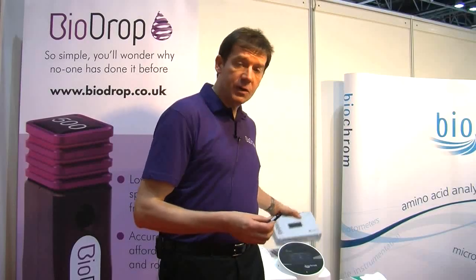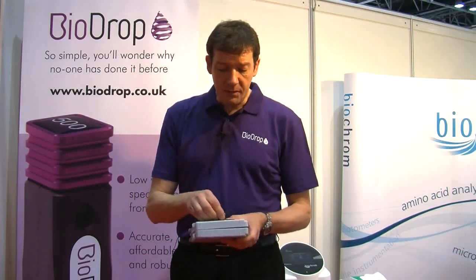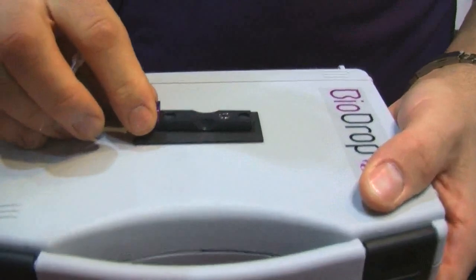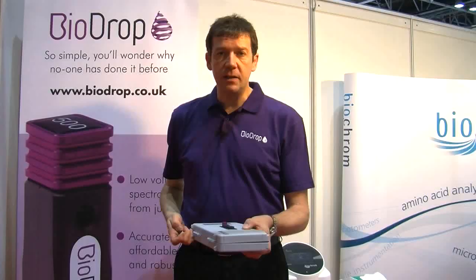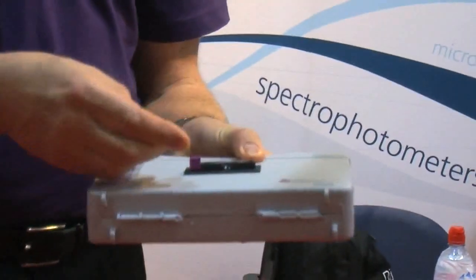When you're pipetting on small samples, one of the troubles is keeping the cuvette absolutely stationary. So what we've done on this product is put a revolutionary magnetic holding device on the top, so as you can see, that's a very very stable place for you to pipette down onto.